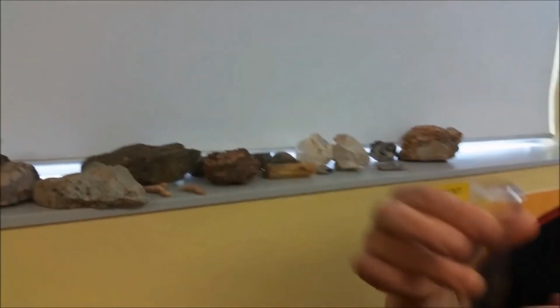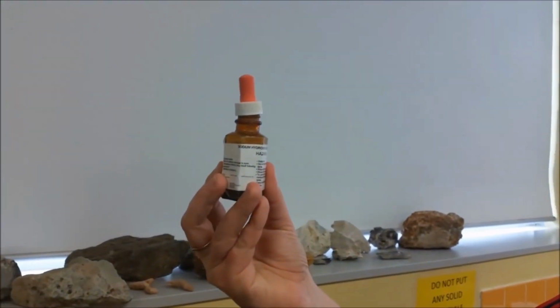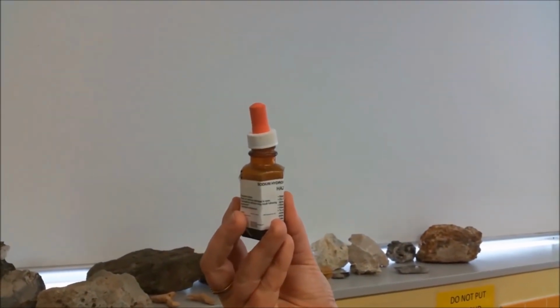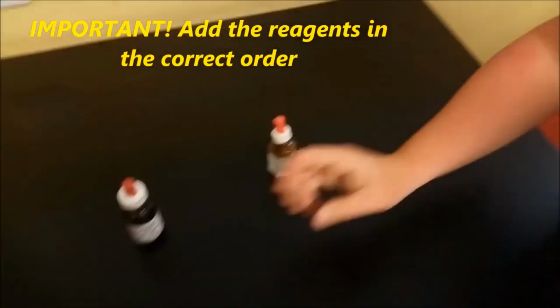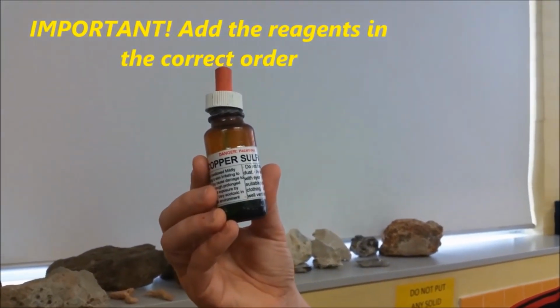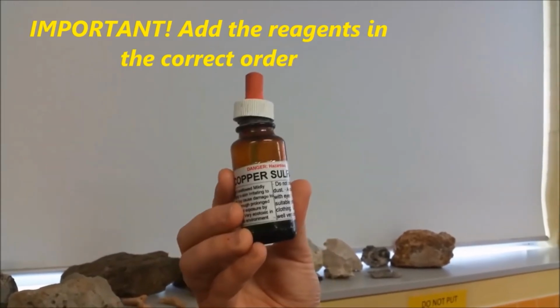All right, the first step is you need to add 1 pipette full of sodium hydroxide. That's really important because you've got to add 2 reagents in this case, so make sure you get 1 of each bottle. They are labelled sodium hydroxide. The other reagent is copper sulfate. Okay, so make sure that they are in separate trays. Make sure you get 1 of each.